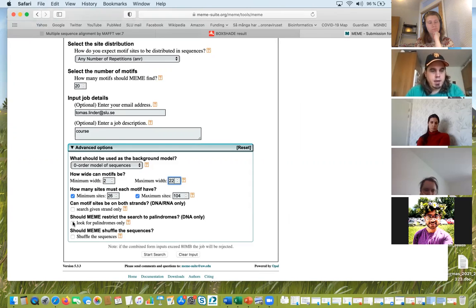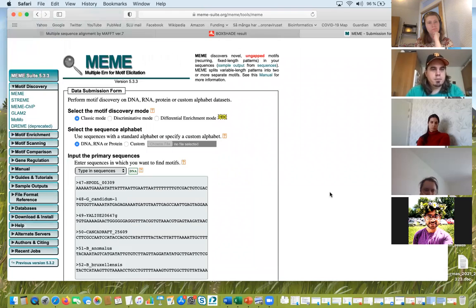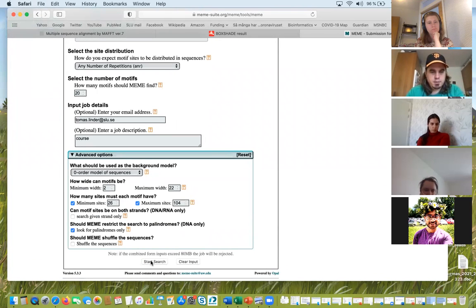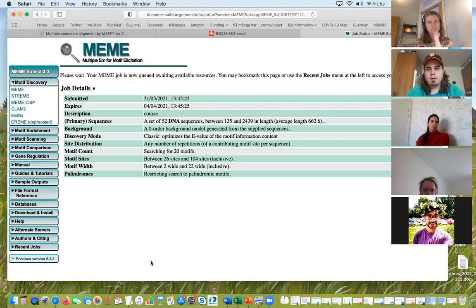And let's say look for palindromes only. Where's the button? Am I blind? There it is. Start search. There we go. And now that's going to take a while. Okay, so that's how you do it.